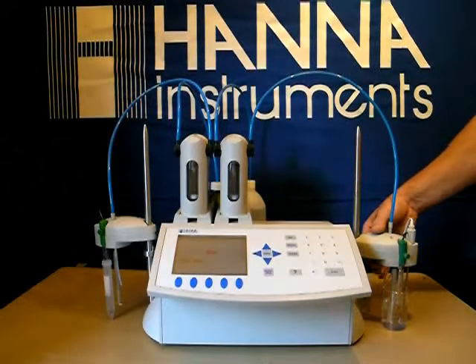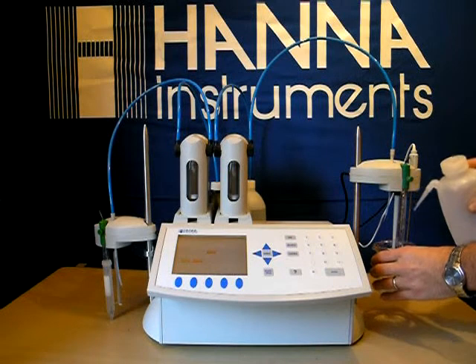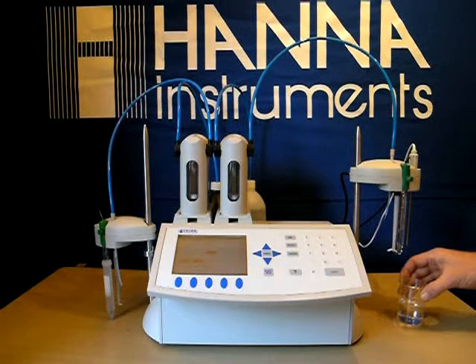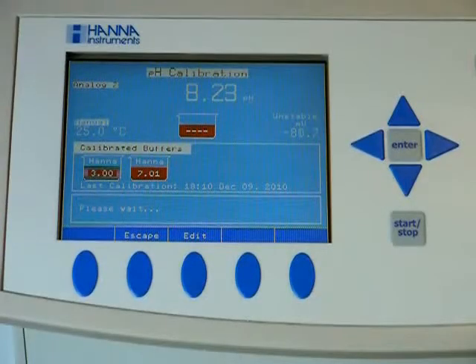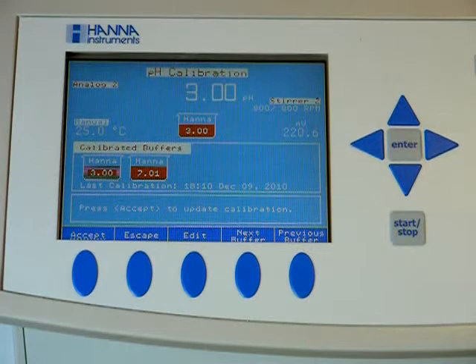Now we will change to our 3.0 buffer. Give it a quick rinse in between. Once again, turn on the stir feature, click on the stir feature, and wait for our probe to stabilize. Then hit accept.